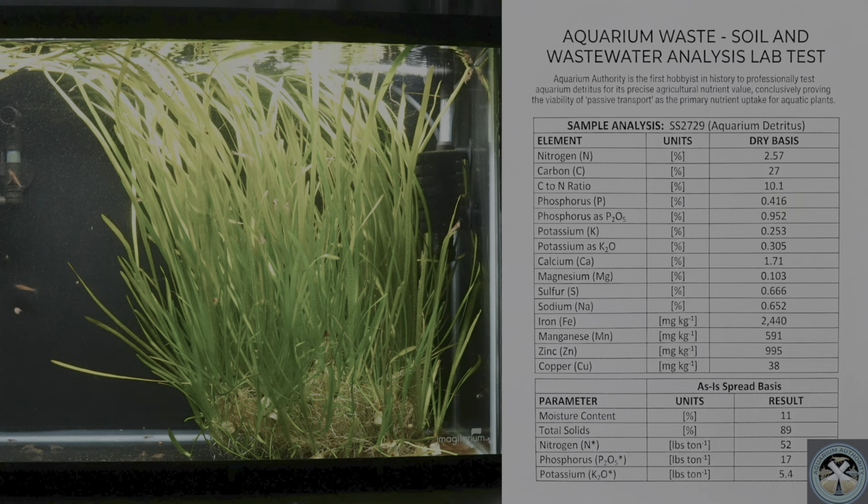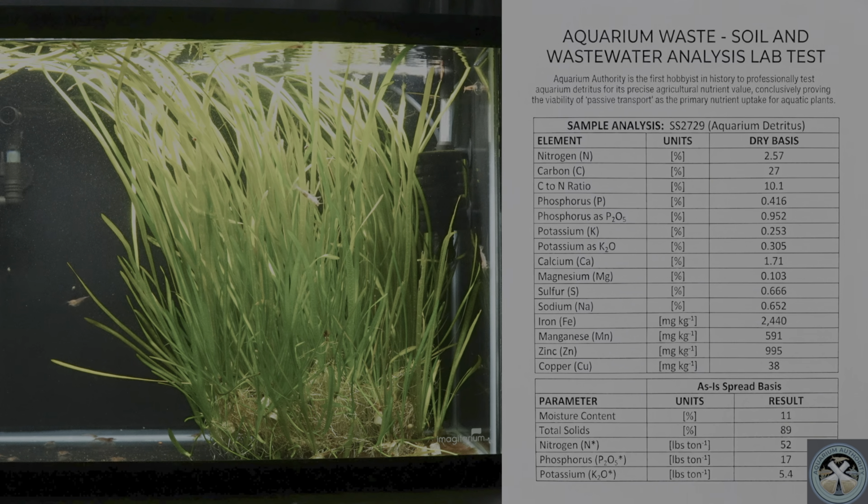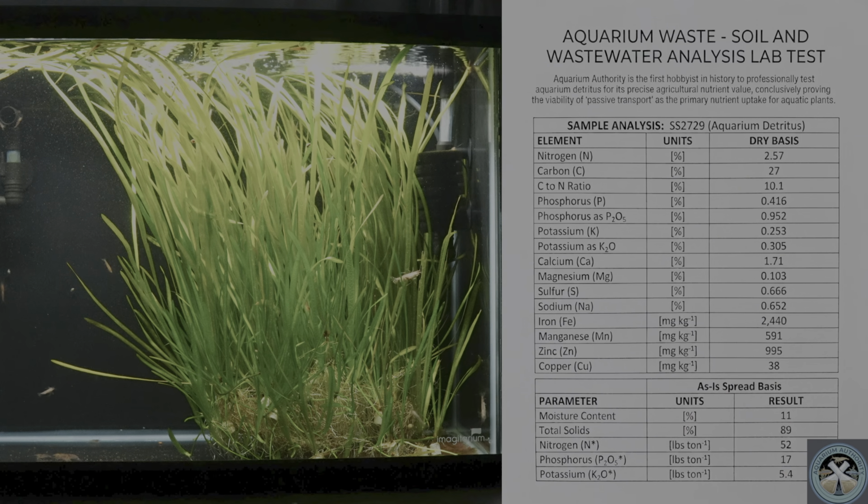So for the dry basis, imagine taking aquarium gunk and putting it in an oven until every single drop of water has evaporated out of the detritus. What would be left is 100% solid with no moisture. This is the dry basis, and the measurement of the dry basis tells you the true potency and nutrient profile of the material itself without the water diluting the numbers.